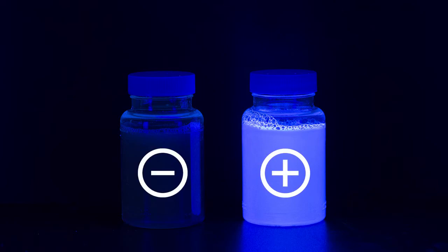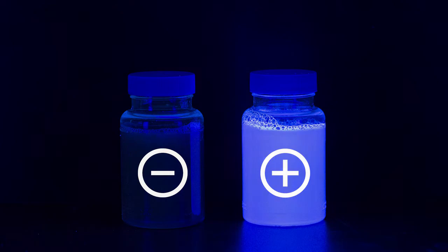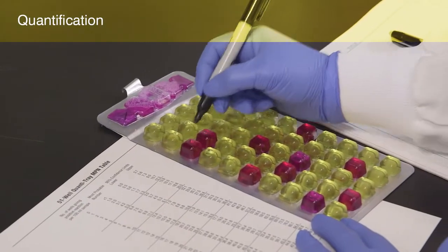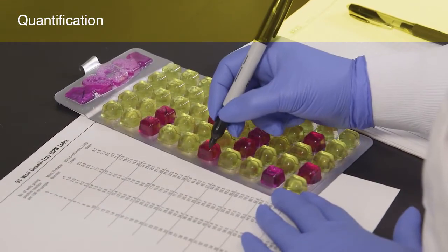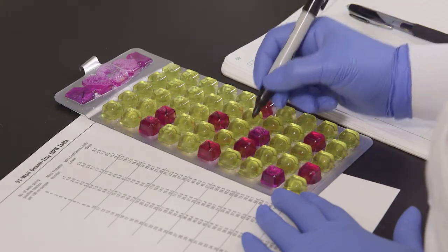If there is no fluorescence, the sample is negative for E. coli. Next, you'll learn how to use the ColiShore test with the QuantaTray system to determine the number of coliforms and E. coli in a water sample.